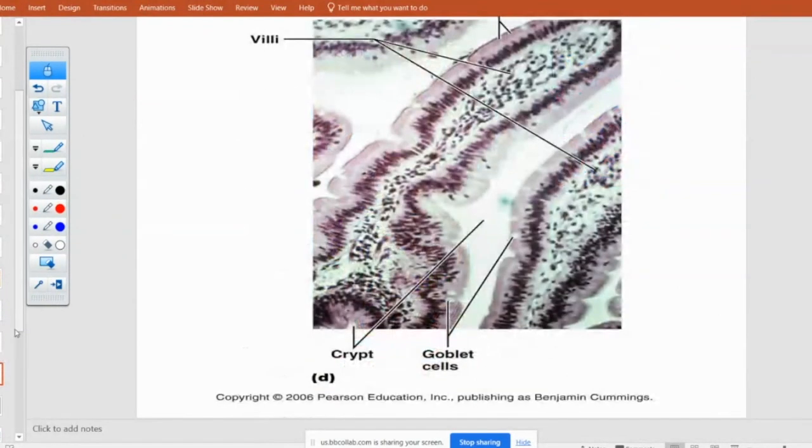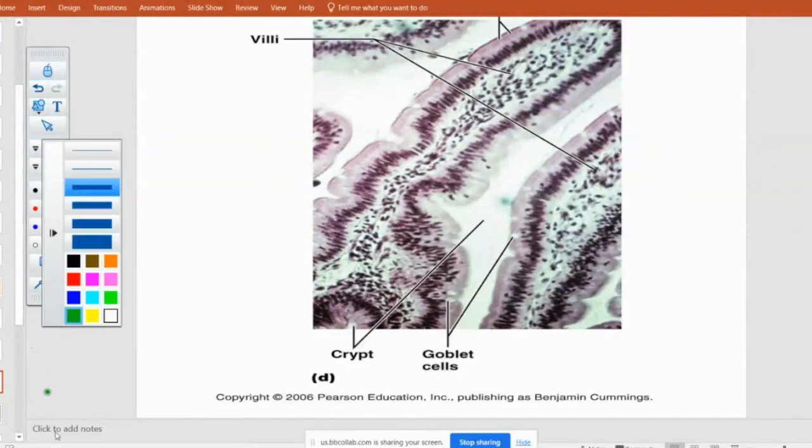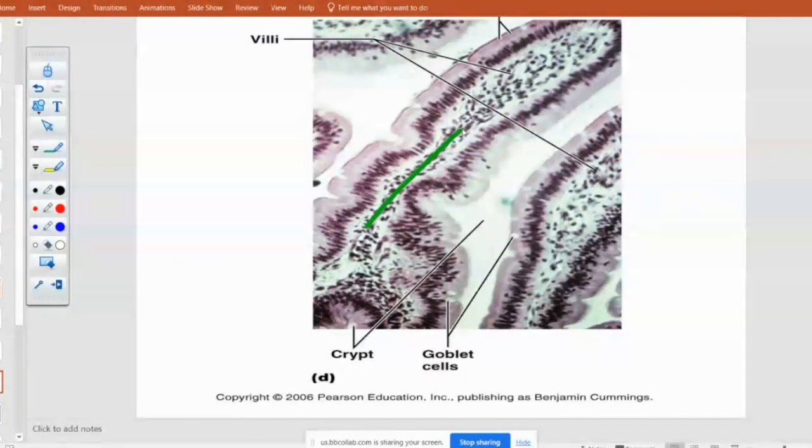Now this picture I love. I wish I could say I took it. I didn't. The publisher did. Okay. Here is the lacteal. So that means the other things there, that's partially lacteal and partially cells of the capillaries you're seeing there. Here is our little basement membrane going around.